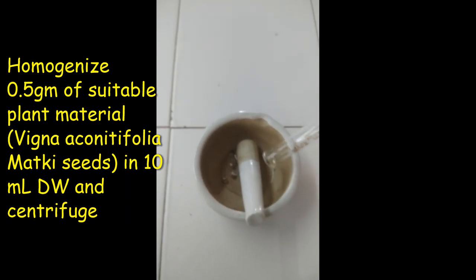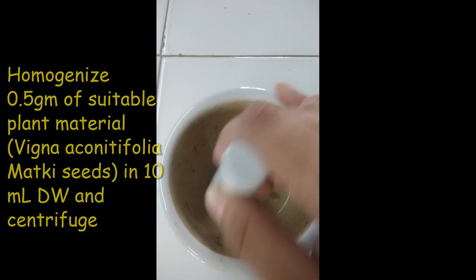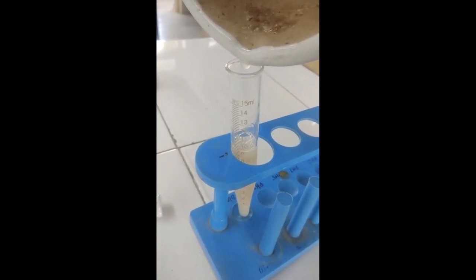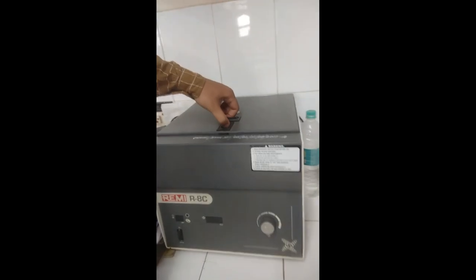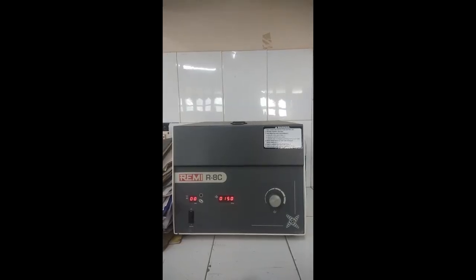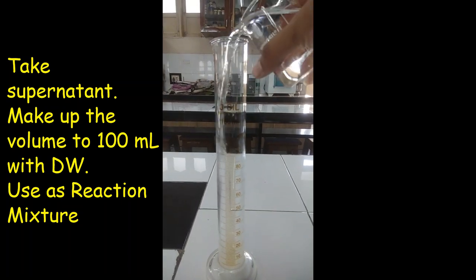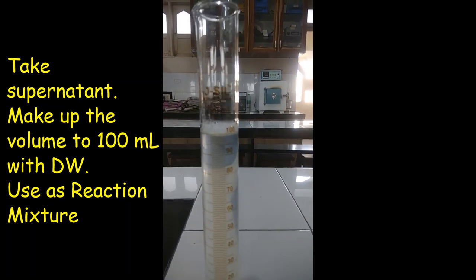To prepare reaction mixture, in a mortar, homogenize 0.5 gm of matki seeds in 10 ml distilled water. Transfer the content in a centrifuge tube and subject it for centrifugation. Instead of centrifugation, one can simply filter the content through muslin cloth. After centrifugation, transfer the content in a 100 ml measuring cylinder and make the volume up to 100 ml with distilled water. The resulting content can be used as reaction mixture.